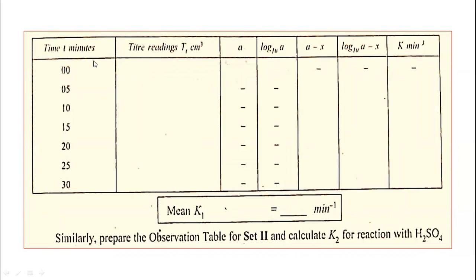in the observation table. You can see here, this is the observation table. Time t, this is the zero reading. Zero time reading means after the mixing, immediately we have to titrate the solution with sodium hydroxide solution.